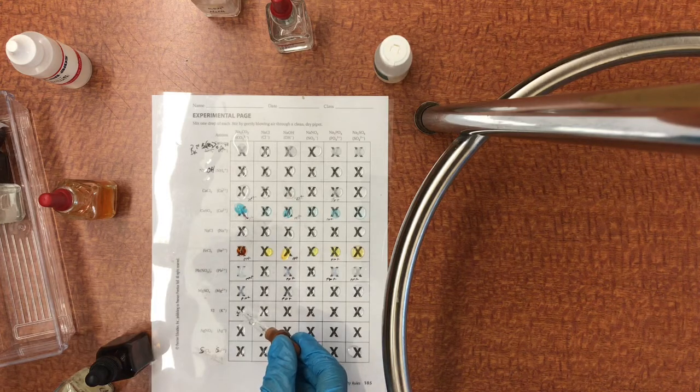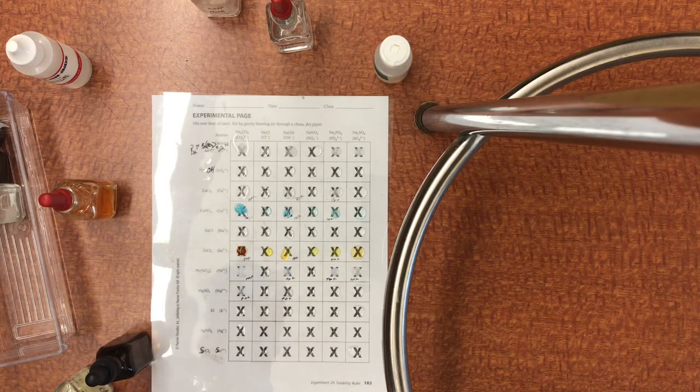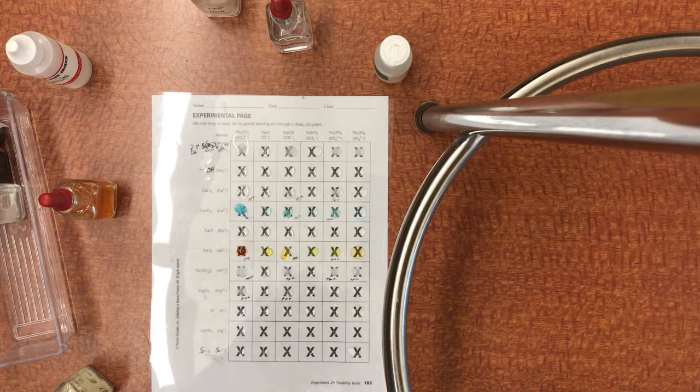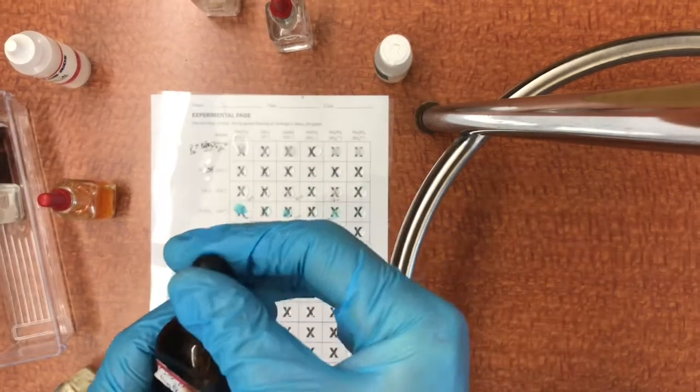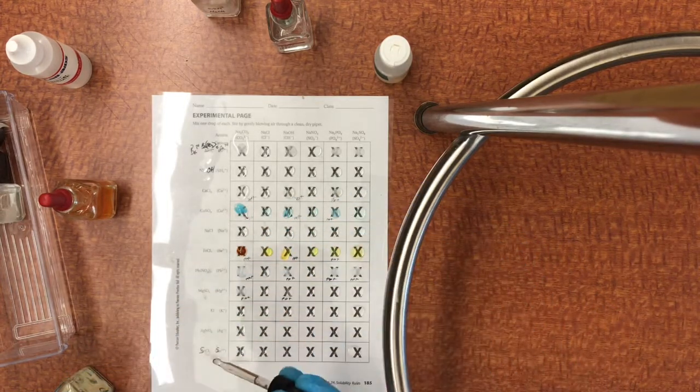Here's potassium. Potassium is a first row element again, so we are not expecting strong reactions. First column, I should say. And so potassium has no reactions. And then the last two here, I have silver nitrate. So that's my silver nitrate. It's just a nice clear. It's sometimes a little bit brownish in color.